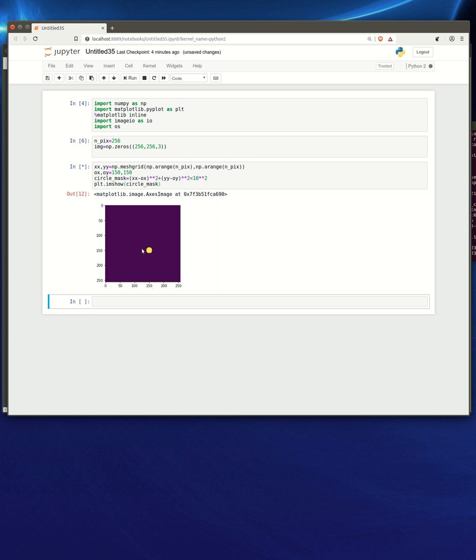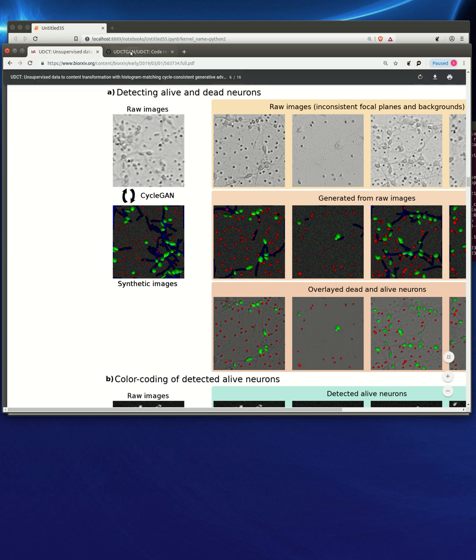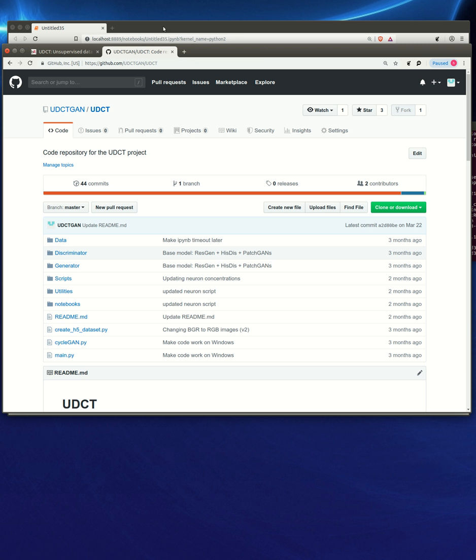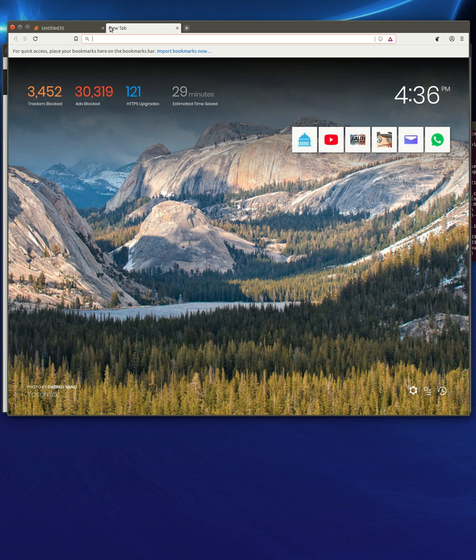And so the point now here is to maybe not do a circle, but an ellipse, something a bit more complex, because these cells seem a little bit more elongated. The circle might be enough for the dead cells, but not for the live cells. We will just introduce enough variation that it looks to us like the original images. Because we don't remember exactly how this formula would look for an ellipse, we're just going to go on Stack Overflow and look for the equation of an ellipse, maybe a rotated ellipse.